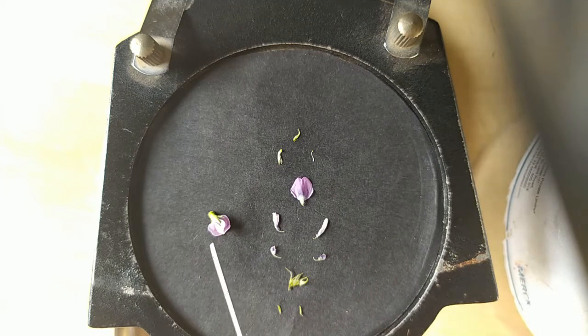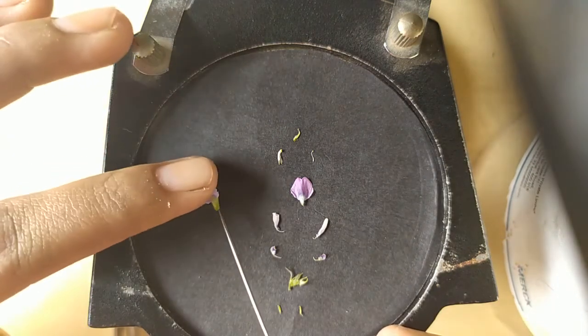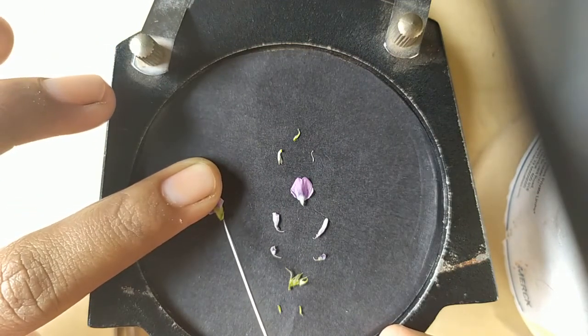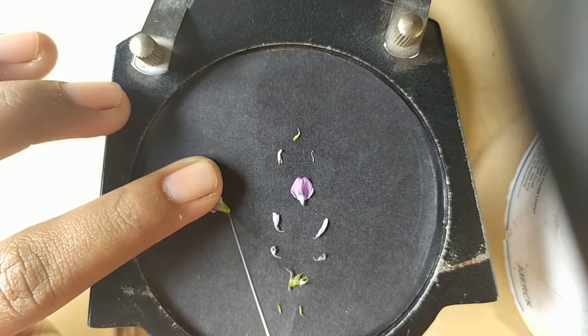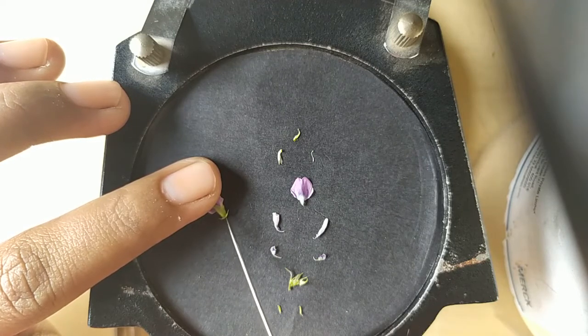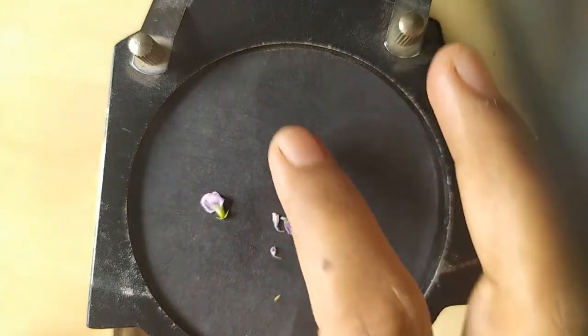If you observe here in this flower, the bracts are present on this calyx. I am showing it with the help of a needle. On opposite sides of the calyx, the two bracts are present. These are the bracts which are present on that calyx. So the calyx here is fused together, the condition of calyx is gamosepalous, and on the calyx two bracts are present. So now we start the dissection of soybean flower.